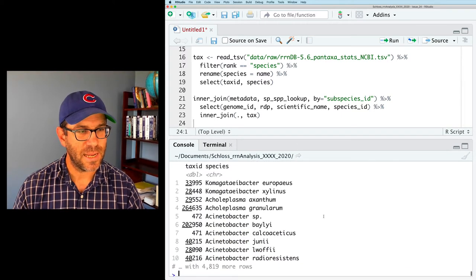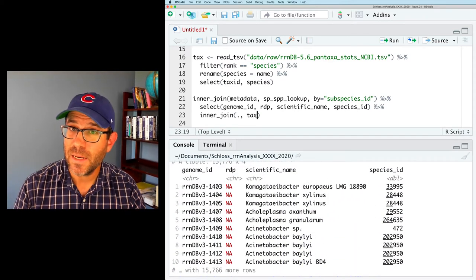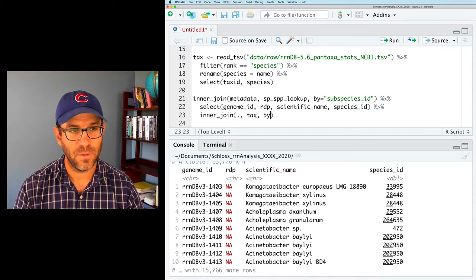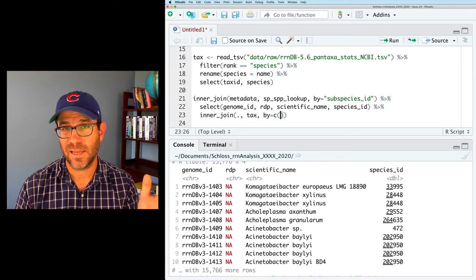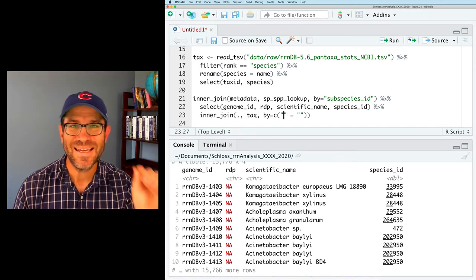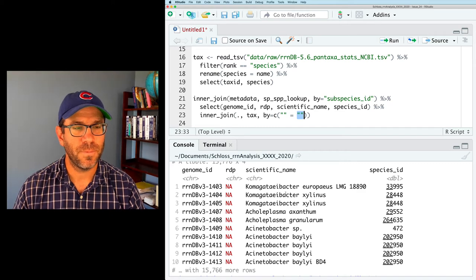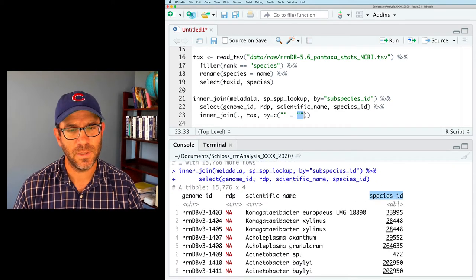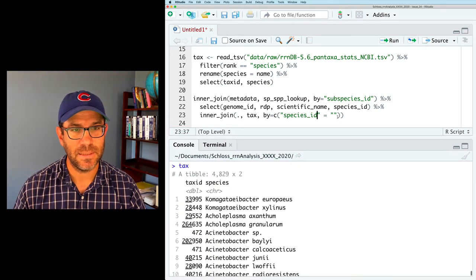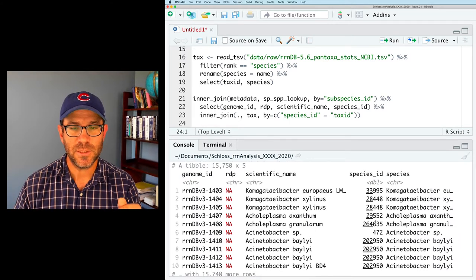Instead of renaming columns, I'll show a different way using the by argument. The syntax is: by = c('species_id' = 'tax_id') — using the concatenate function where the left side is the column name in the left data frame (species_id) and the right side is the column name in the right data frame (tax_id). Running all that, it works. We now have genome_id, rdp, scientific_name, species_id, and species. We won't need the species_id going forward.